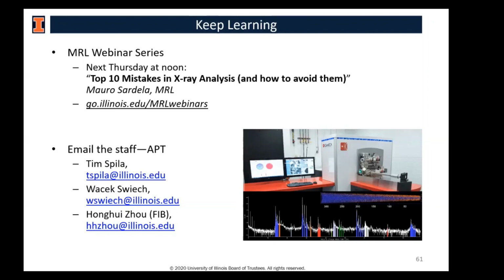One other advantage of atom probe over something like SIMS: in SIMS, not everything that gets sputtered away comes off as an ion, so you can't measure it. But with atom probe, everything that comes off the tip has to be ionized, and so you have the ability to measure it up to 80% because the detector isn't able to take everything in. Good. Channel plate mostly, the holes in the channel plate.